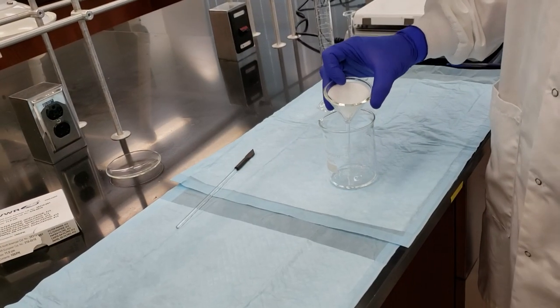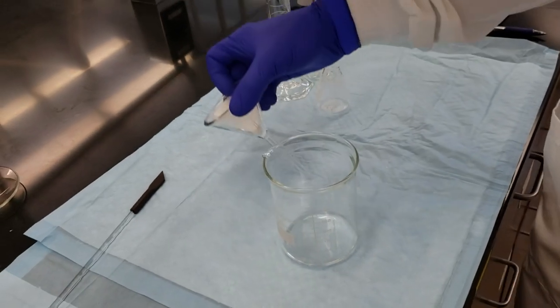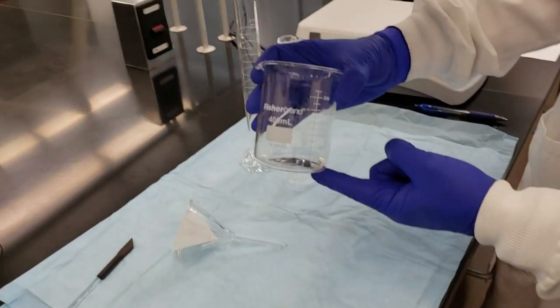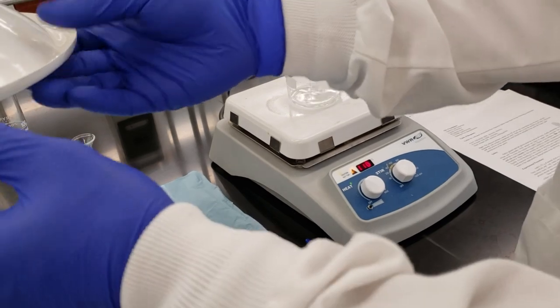Our gravity filtration is finished. As you can see, we've captured all of our aluminum oxide on our filter paper here. So we're going to set that aside. So we have our ethyl acetate with our product in our beaker. We're going to set that on top of our hot plate.